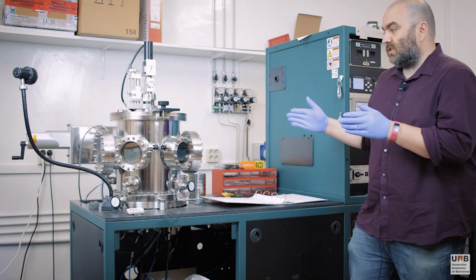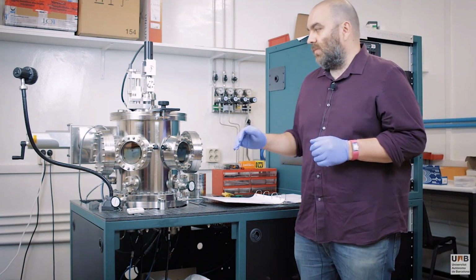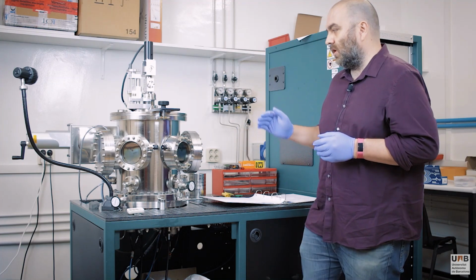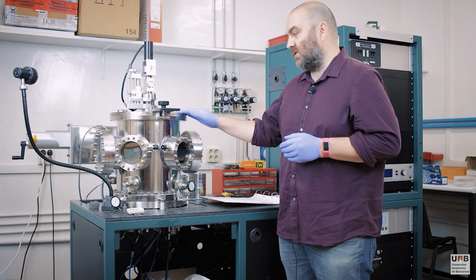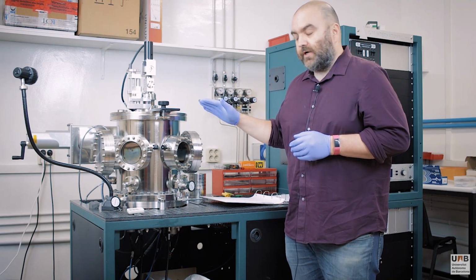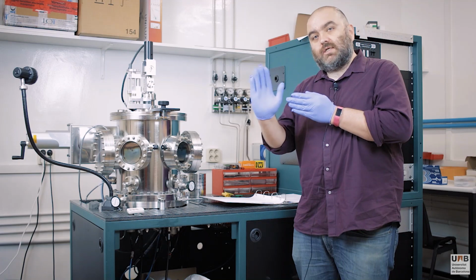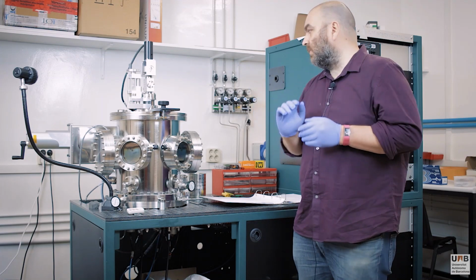So, this is our sputtering chamber. This is very common, and we'll have a lot of common features with anything that you have in your lab. And the important things are the chamber itself, which contains all the things you need to do the sputtering. There's the vat valve in the back, which controls the pressure that is being contained in the chamber during sputtering.